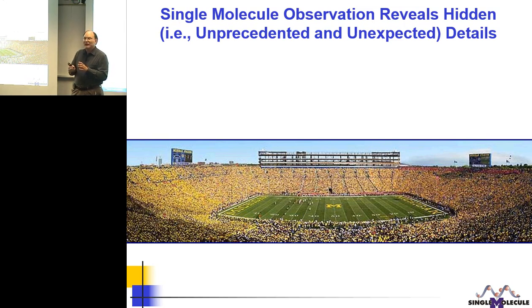So that we basically end up doing a time-lapse experiment. That is, to take different time points. We decide, OK, 1 minute, 10 minutes or so later, we look at the system. Right, so then photobleaching, phototoxicity is not really an issue because we're only looking at the cell for a short period of time. But we are interested in the dynamics on a much shorter time scale than the lifespan of the cell, and therefore we can learn something.